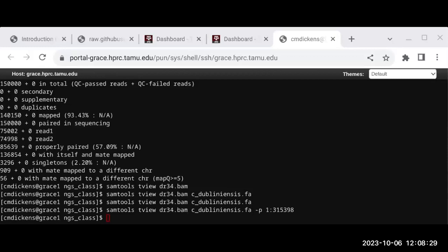The DNA at the peaks is not going to be the exact same. It's going to have a motif. So you can create a motif image like this based on all these peaks across your genome, and the seqLogo package is there to create that in R, if you want to create that logo. And then we have tools like MACS, deepTools, and SICER. Those are used a lot by our users.